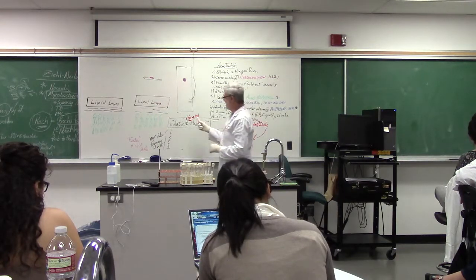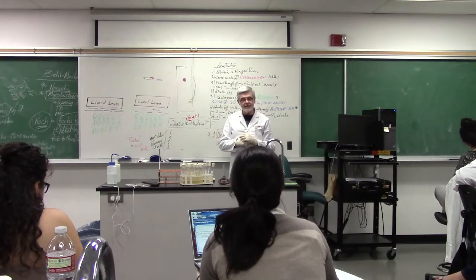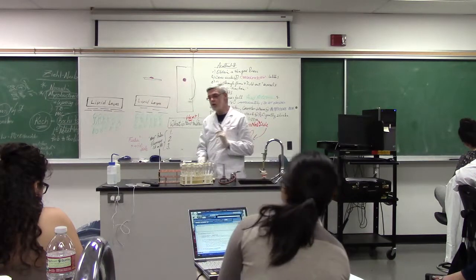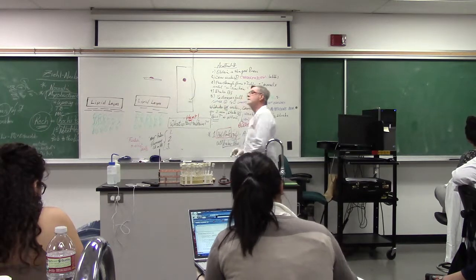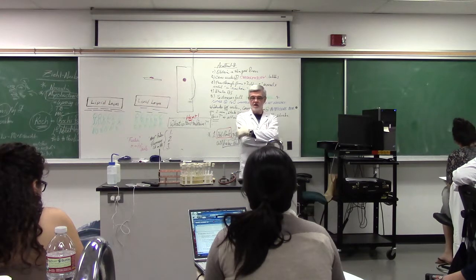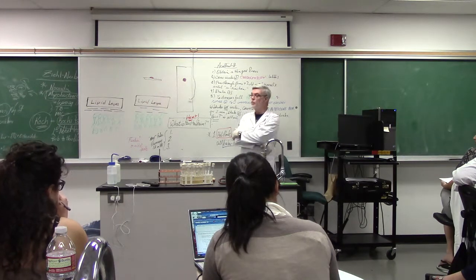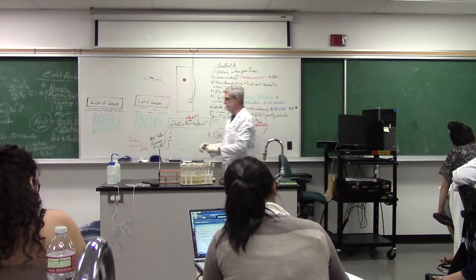And whenever you see the word heat, the secret communication we're trying to get across is, it's hard to stain this. It's hard. And if it's hard, you've got to involve heat. Now, in our class, in microbiology, name 3 things that are hard to stain that you may or may not have come across or have read about, or even used logic on one of them. We already knew one thing that's hard to stain. What is it? Lipids. Lipids are hard to stain.